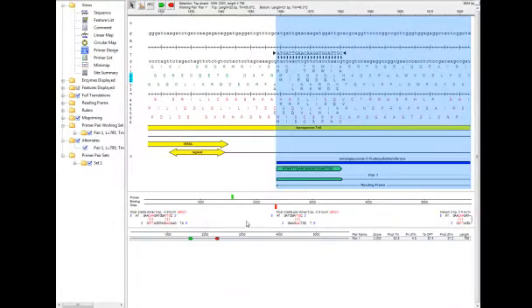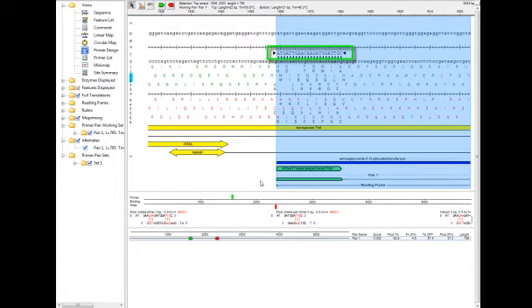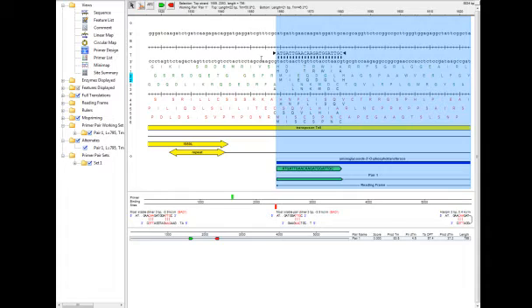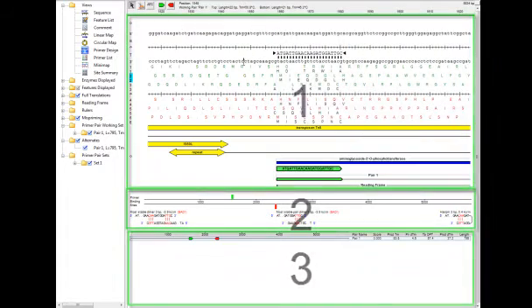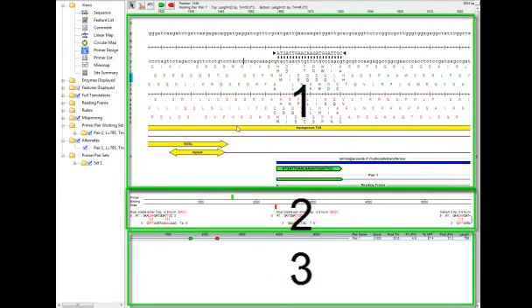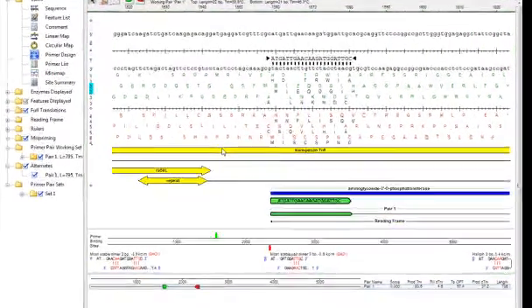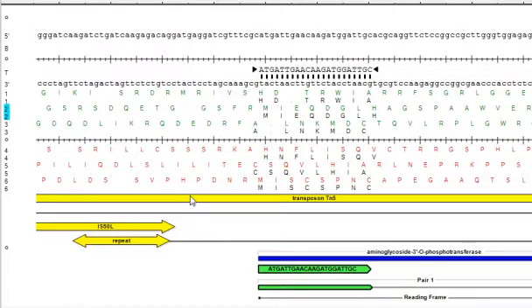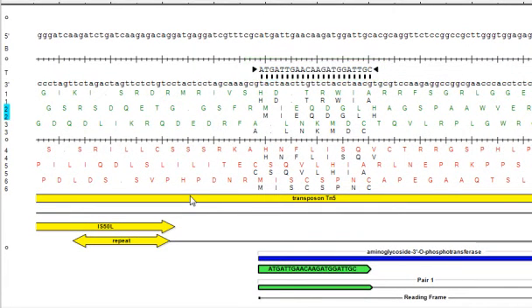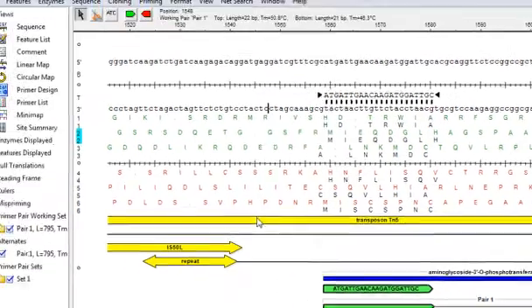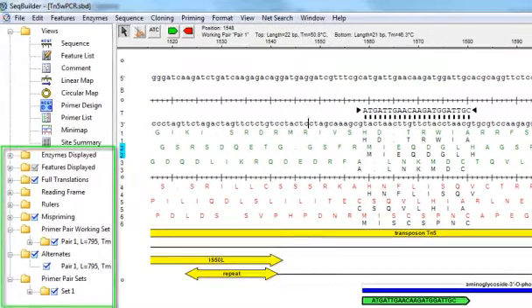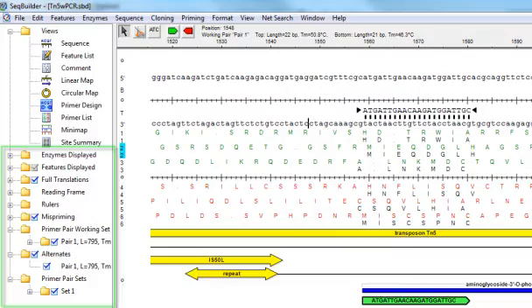And now I can see the Primer Design view with my top strand primer displayed here. The Primer Design view is divided into three panes. The top pane here displays the base level nucleotide sequence, the selected primer sequence, as well as restriction sites, translations, and features. And again, all of these items are controlled here from the curtain.